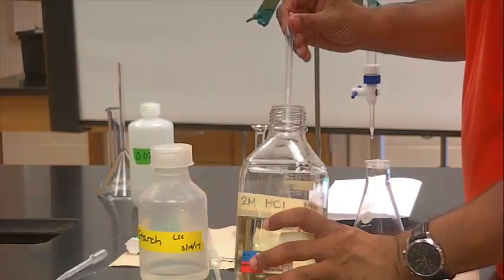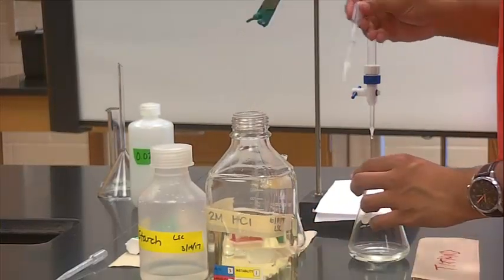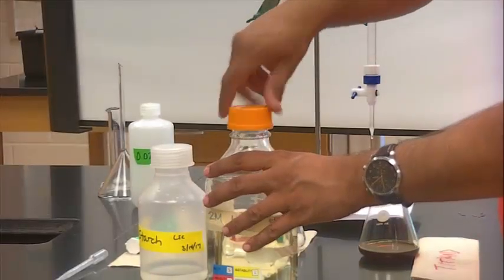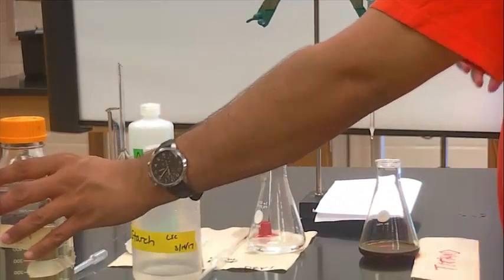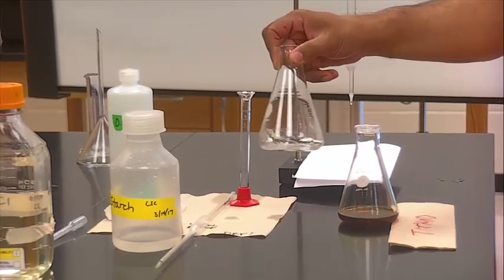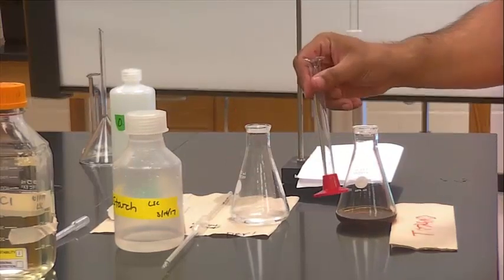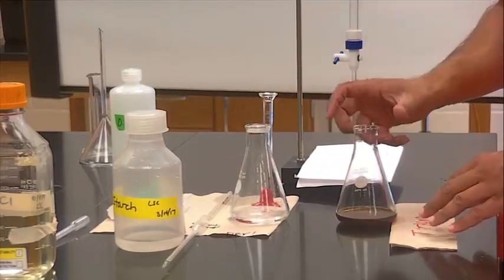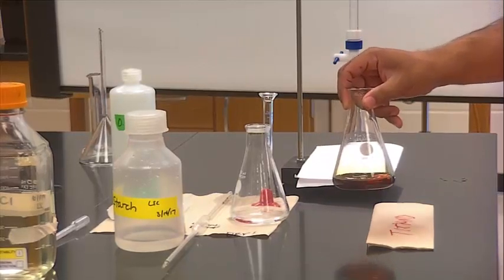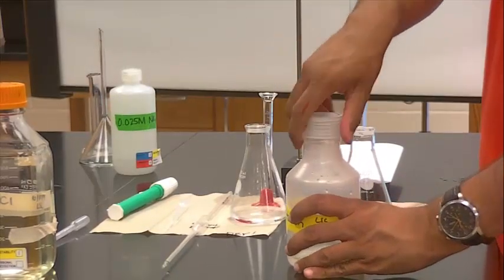Add about 20 drops of the HCl. About 20 drops. Now notice what's happening here. The IO3 minus from your precipitate that you filtered out from the filtrate has reacted with the potassium iodide pellets in the acidic medium, and now you get this color here. This causes the generation of I2, molecular iodine. To enhance the color, I'll just add 40 drops of starch.